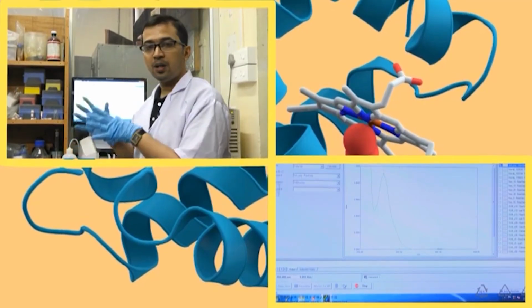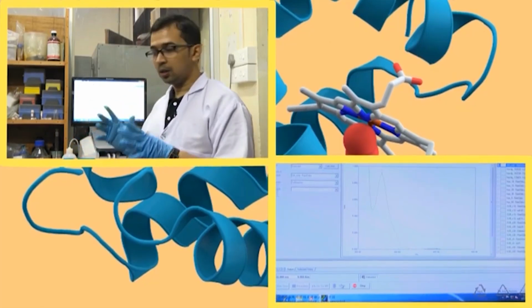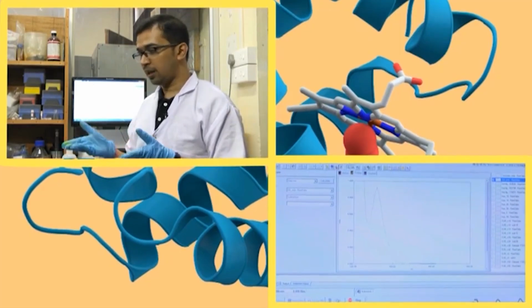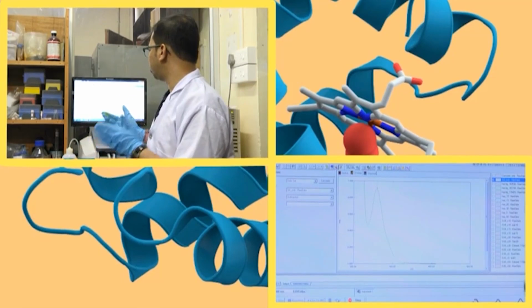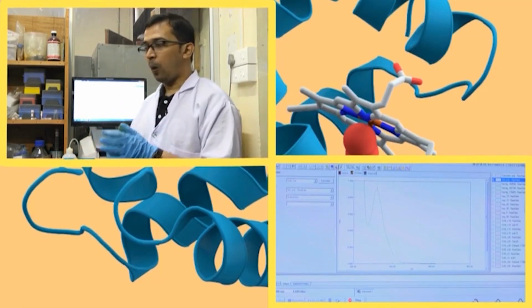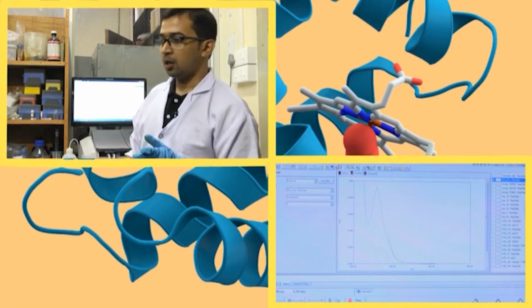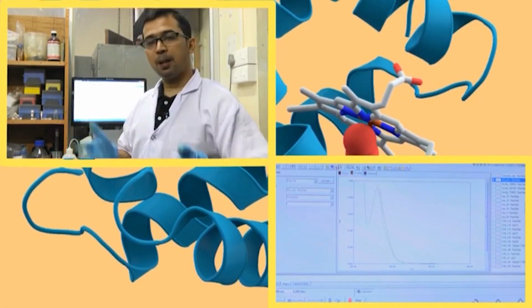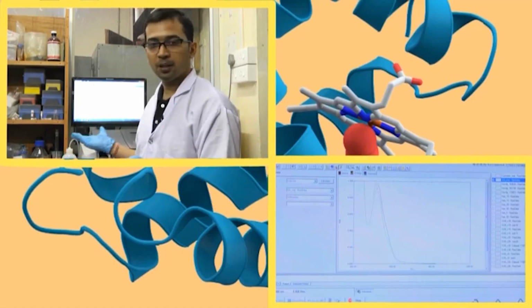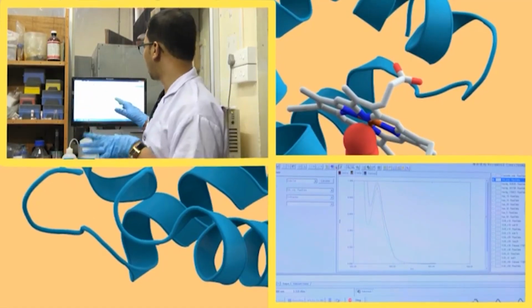However, out here we actually have the control, or rather the absorbance for HSA only, for 5 microliter, 10 microliter, and those will be used for subtraction. Okay. Now, why am I using those? Because I am doing this at a stretch. If we run an experiment keeping the same temperature, same condition, same experimental setup, at a stretch, then those controls we can use for subtraction out here.